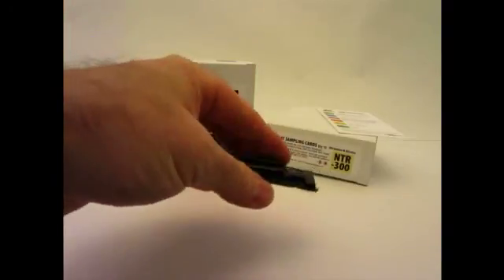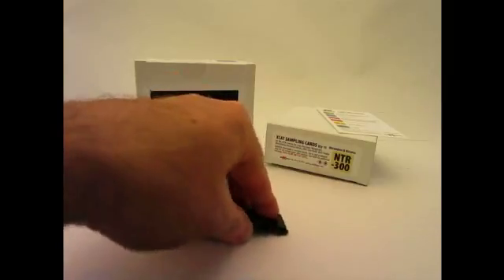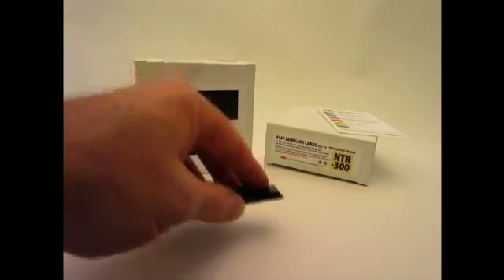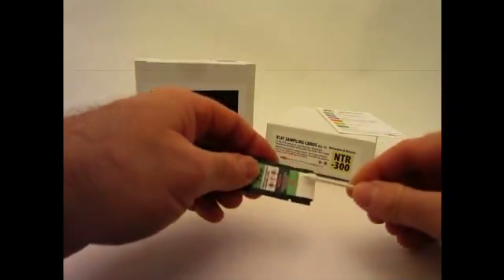Samples can be collected on the sampling cards by three methods: one, by directly grinding the paper onto the surface to reduce larger crystals or particles to powder; two, by directly swiping a hand or surface for trace amounts of material; or three, indirectly using a swab or glove to transfer the sample to the card.